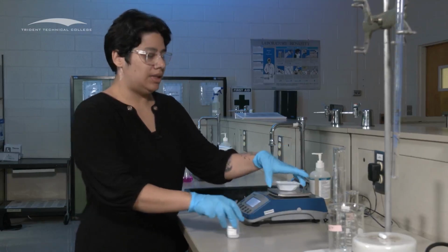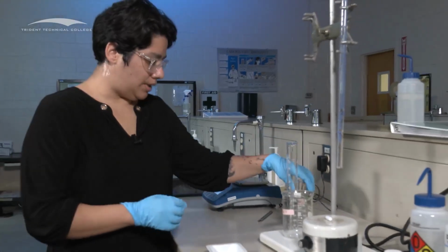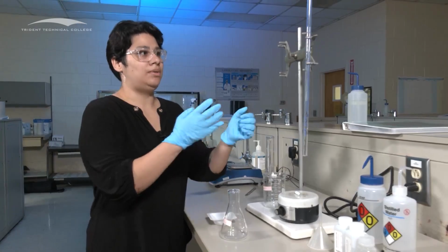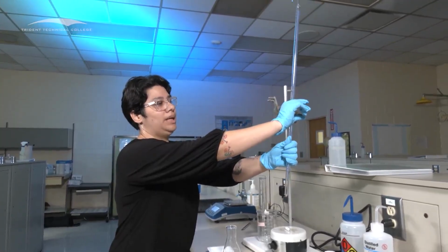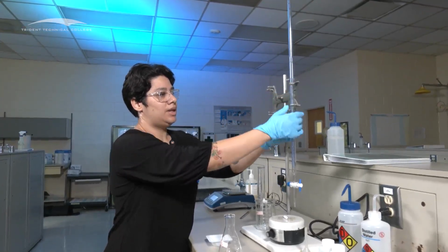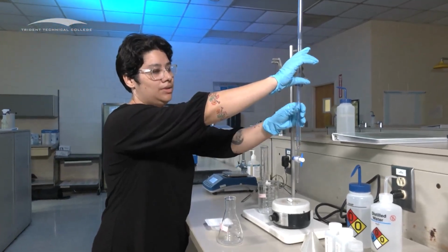So once you have your solid, we're gonna go to our station for a titration. And then we wanna get our trial one ready. So of course you're gonna flip up your burette. Remember, you're gonna grab it from here, and then you're gonna open it, flip it, and then close it. Make sure that it is well adjusted. Sometimes they're tilted, and if they're tilted, they're really, really hard to read.